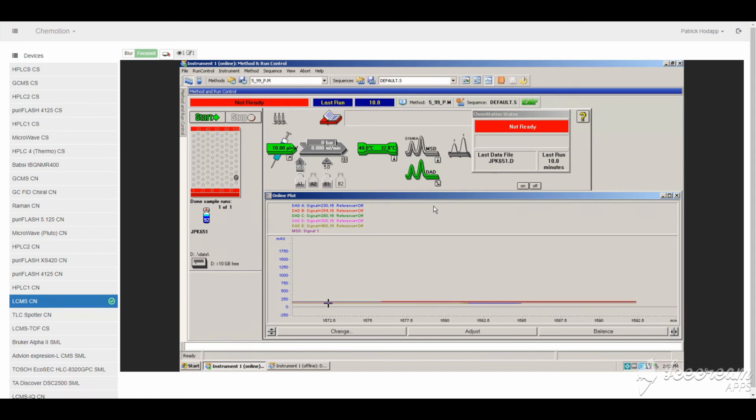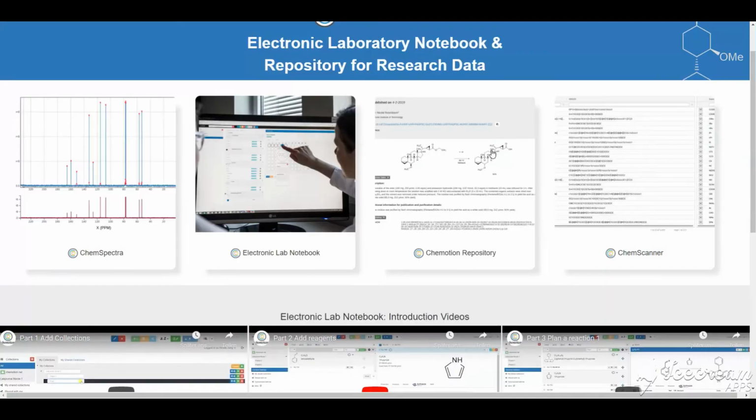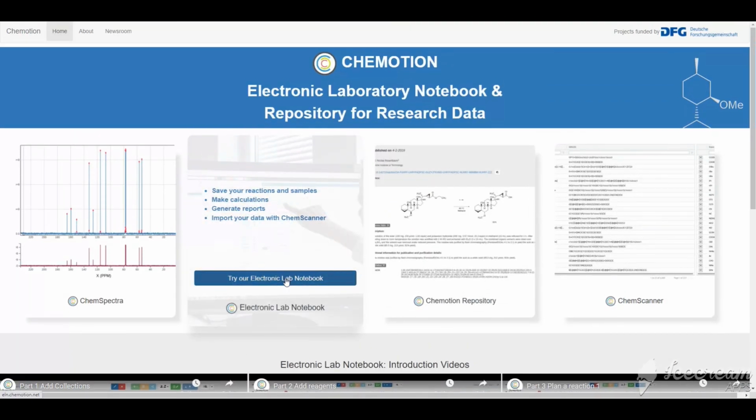And with that, I want to conclude this video. I hope you got a good impression of what the Chemotion ELN can offer and what you can do with it. And I hope you have the time to check out the chemotion.net webpage to also take a look at the other projects involved, and maybe create a demo account to try out the ELN for yourself.